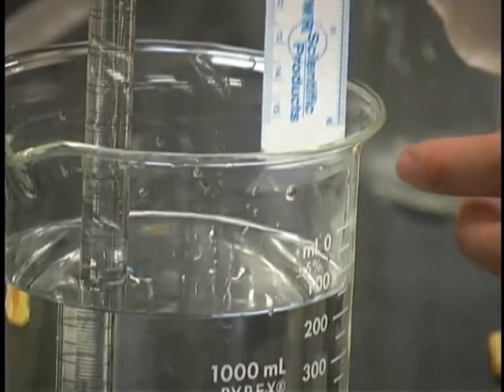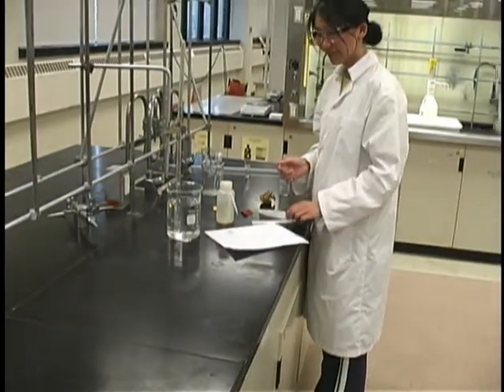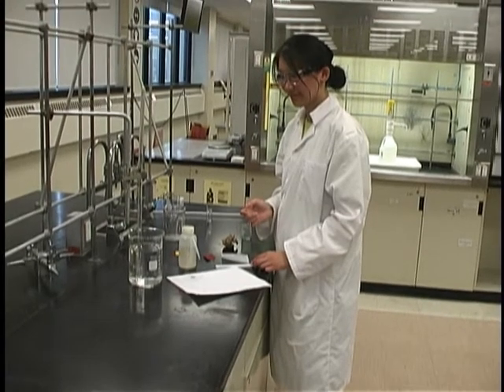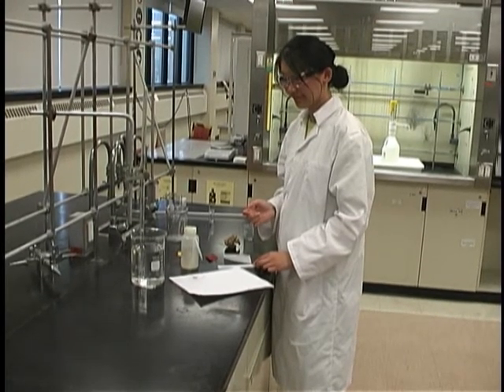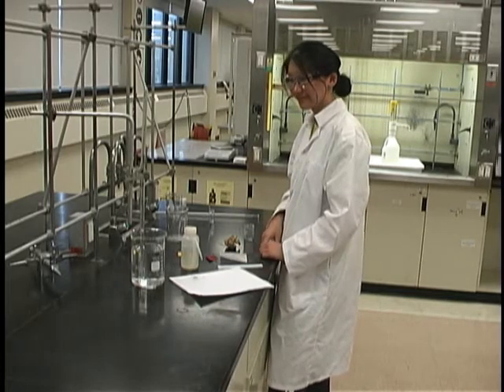For this, you will be provided with a digital thermometer. Last but not least, before you leave the lab, make sure to note down the values of atmospheric pressure and the room temperature that will be provided to you.